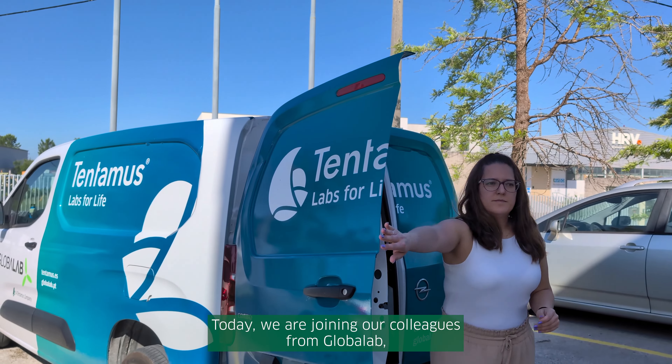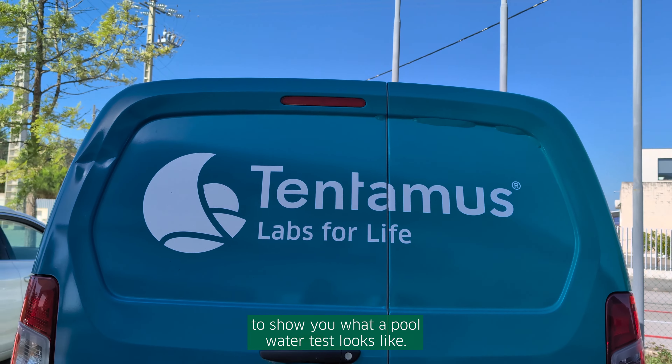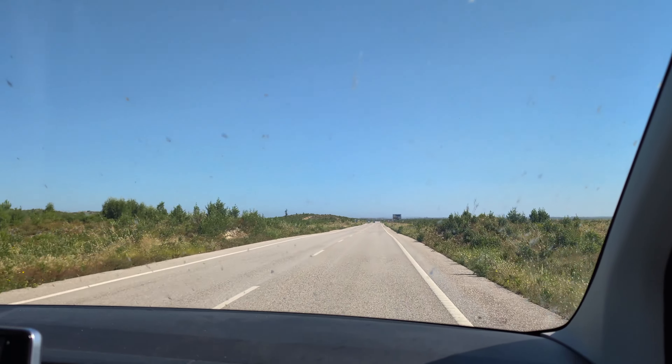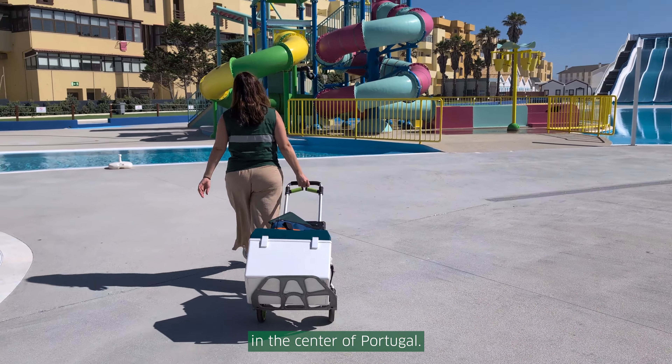Today we are joining our colleagues from Global Lab to show you what a pool water test looks like. We will drive to a swimming pool next to the beach in the center of Portugal.